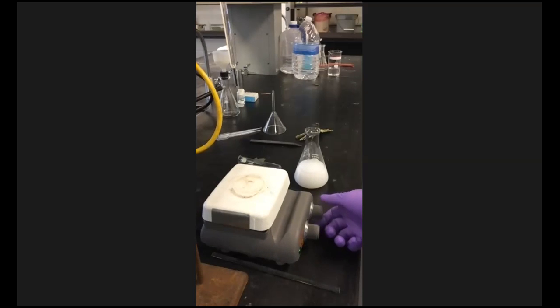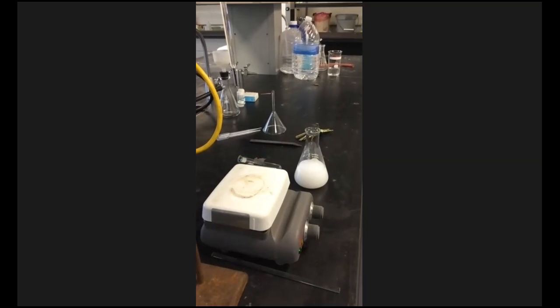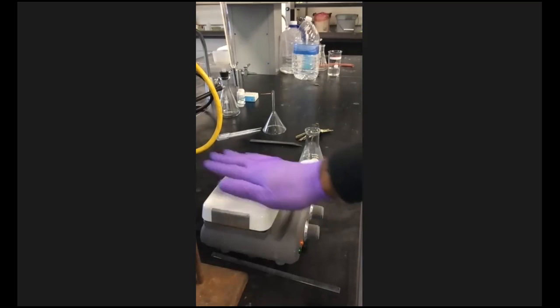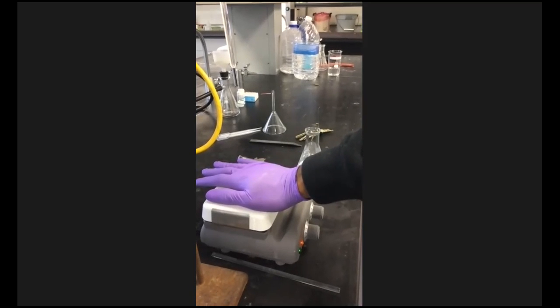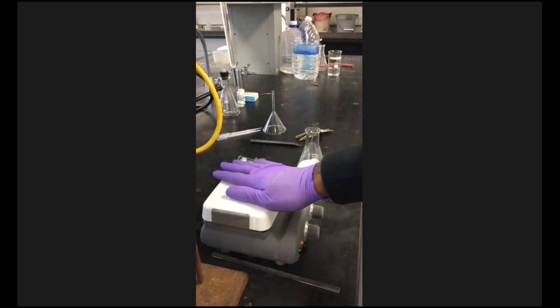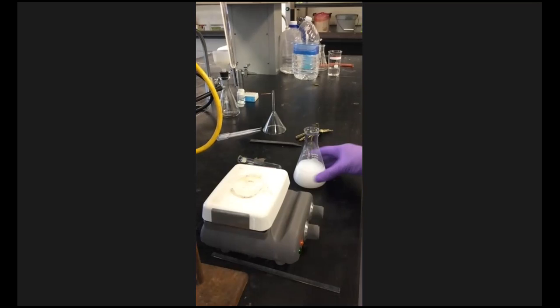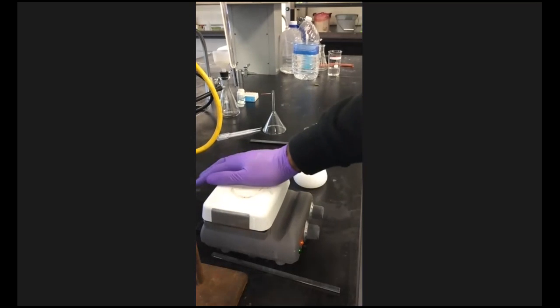All right. So the good thing about these little hot plates is that they are the real deal. And we only want to gently heat it. We don't want to boil it. So I'm only going to turn this up to about 4, right? And I'm going to let the hot plate warm up some before I put the flask on there. Otherwise, it's really going to be like watching paint dry. There we go. All right. So I'm going to let it heat up a little bit more.